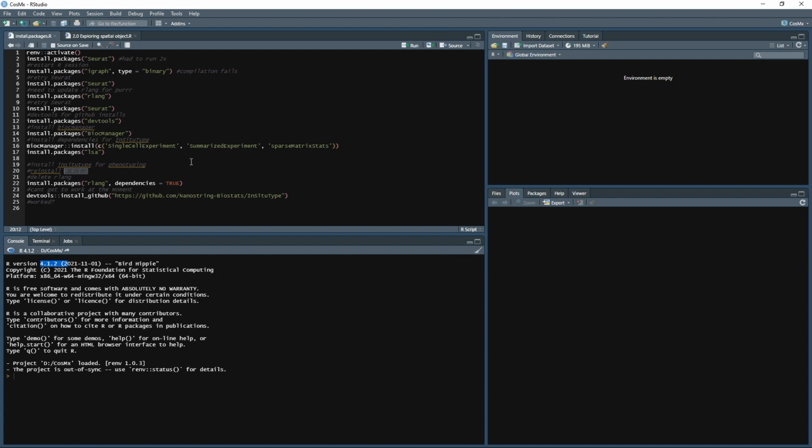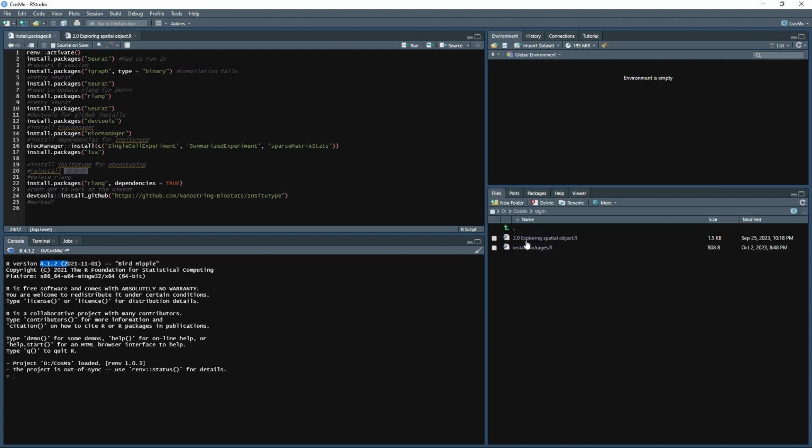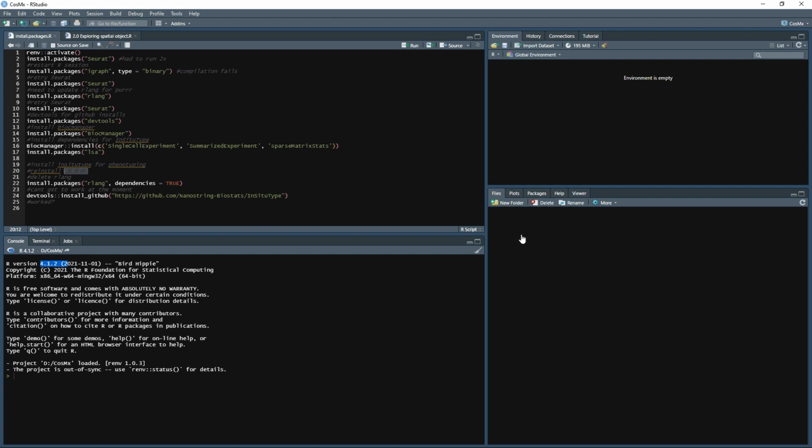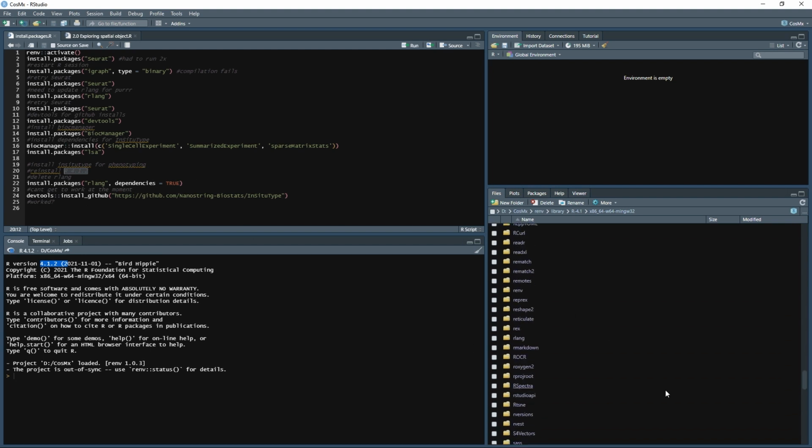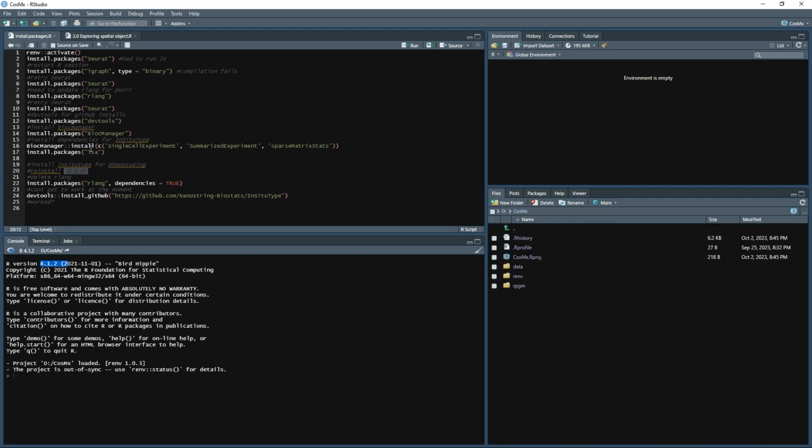And then what I did is I deleted the rlang folder in the R environment. You go library, R4.1, blah, blah, blah. And then down here, they have the rlang. I deleted this folder and then reinstalled with the dependencies as true, and then voila, the in situ type was able to be installed, which is interesting and frustrating at the same time.